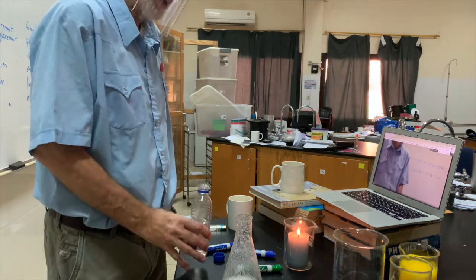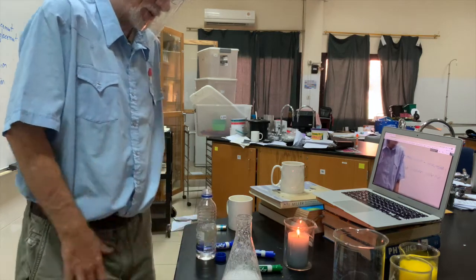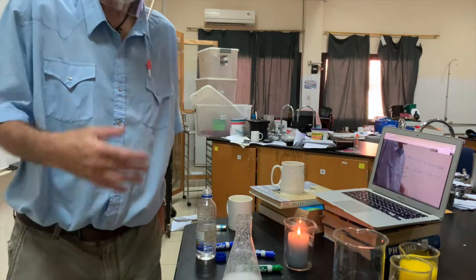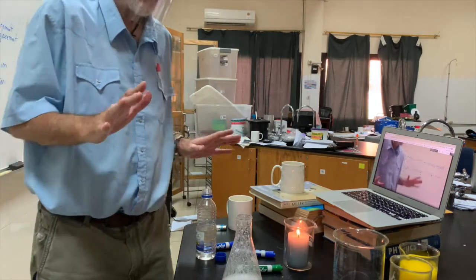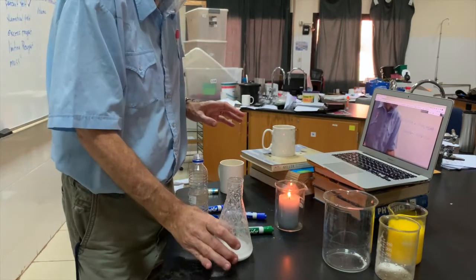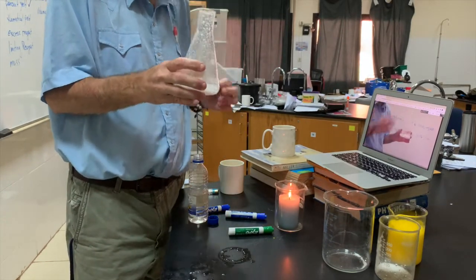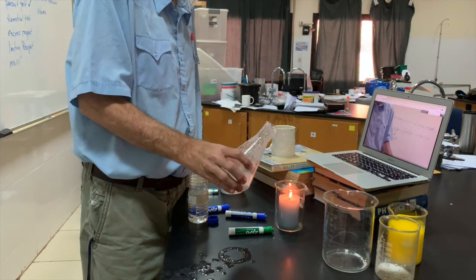So what we'll do is I'll put some more in there just to make sure I have a lot of bubbles. And we're going to check to see what kind of density, can you see this? What kind of density, right, so this is carbon dioxide, it's in here, or maybe it left. Let's see if it's still there. Let's see if it's heavier than air. You ready?